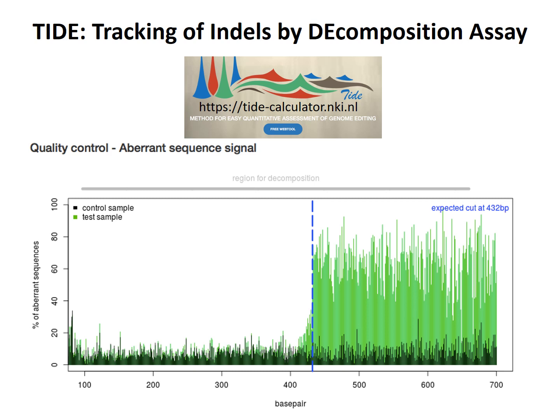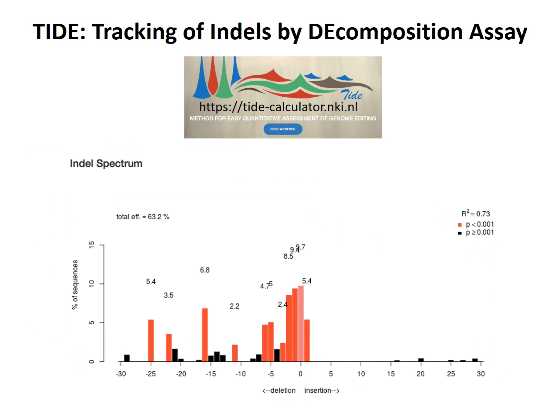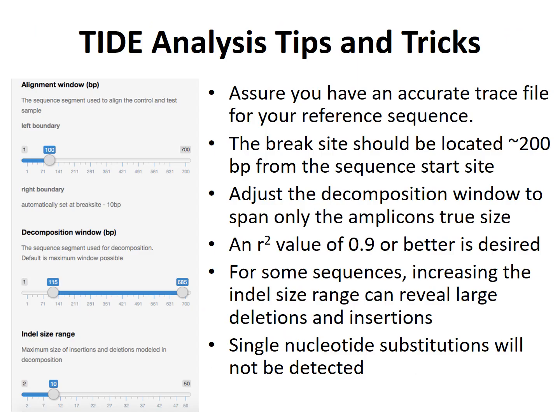This is the sequence alignment window. And so you have perfect sequence alignment here in the first few hundred base pairs. And right before that, you can actually see a little bit of a shoulder where the sequence is starting to align, and then it's really not aligned at that point. And the readout again here is where you have 60% targeting efficiency with this particular guide. This was a really efficient one. It's only about 10% of wild type that is still within that population.